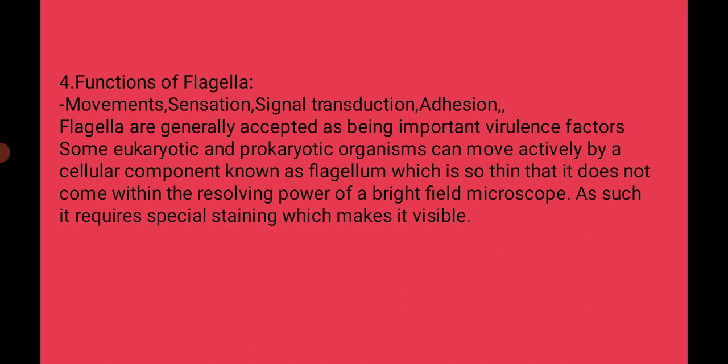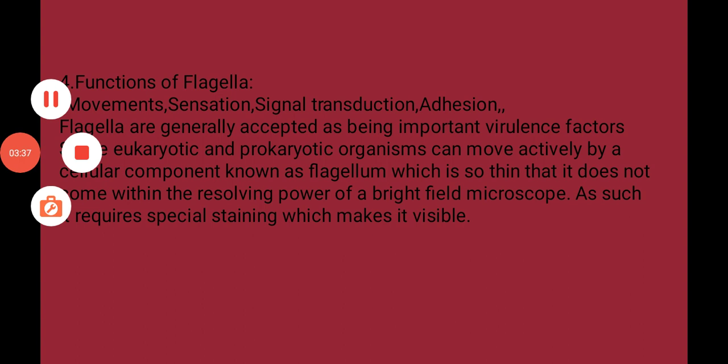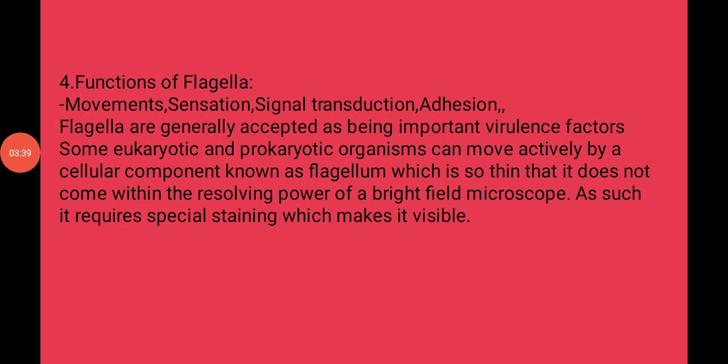Flagella are very thin and delicate in nature. Thus, the flagella are observed under a light microscope by using a special staining technique. And for flagella staining, the Leifson method is used. In this Leifson method, the diameter of a flagellum is increased by coating it with a mordant, that is tannic acid, and then stained with basic fuchsin.